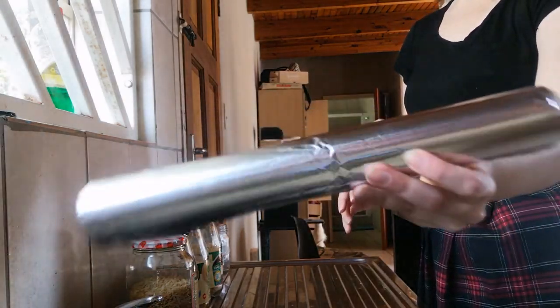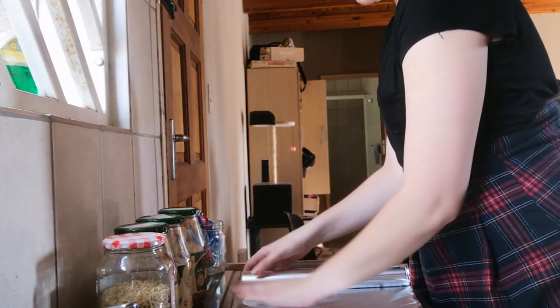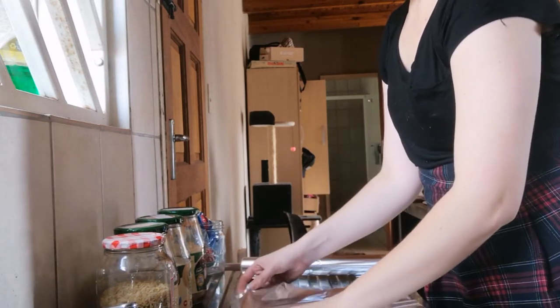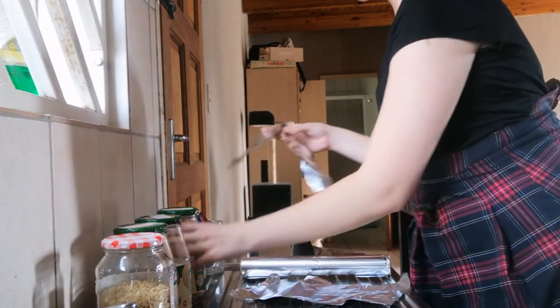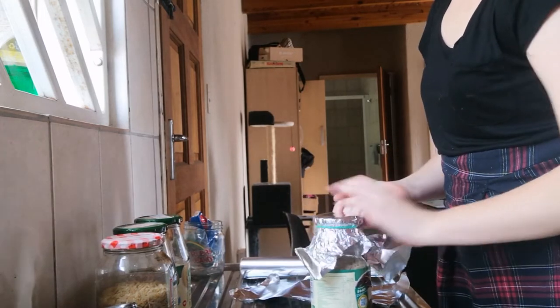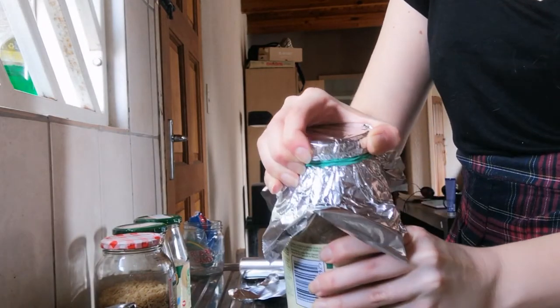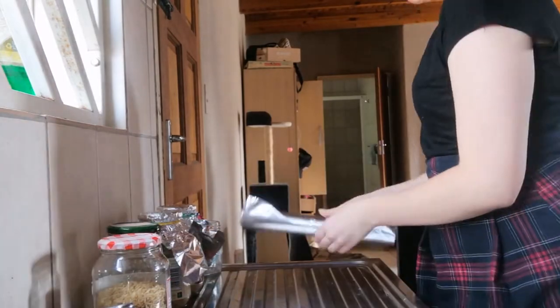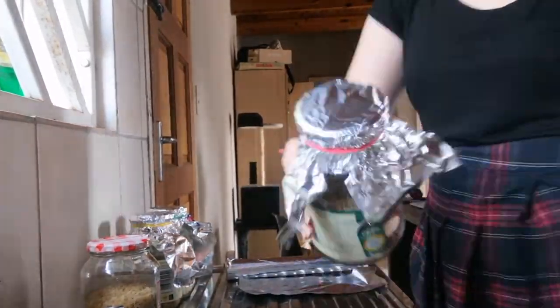For the next step, take foil and rubber bands. Tear or cut pieces of foil and cover the jars with the foil — this helps with sterilizing the jars, prevents anything from entering, and allows for oxygen exchange. Place the foil on the jar and use a rubber band to secure it, tying it twice over the jar lid. Then loosen the jar lid slightly — this allows for less pressure to build up since we will be opening the jars later on. Repeat this process with all jars, and remove any labels before putting them in the pressure cooker.